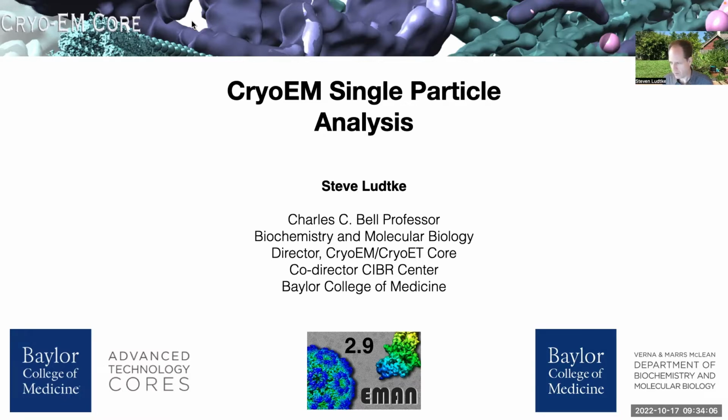So the goal is that today I'll give a little introduction, more or less in the form of a lecture. I don't expect that anyone will have already done anything before today. Then during the week until next Monday, I'd like everyone who's participating to go through the single particle analysis tutorial. That's very robust and straightforward and easy to go through. If you've gone through it before and you're comfortable with all that stuff, that's fine.